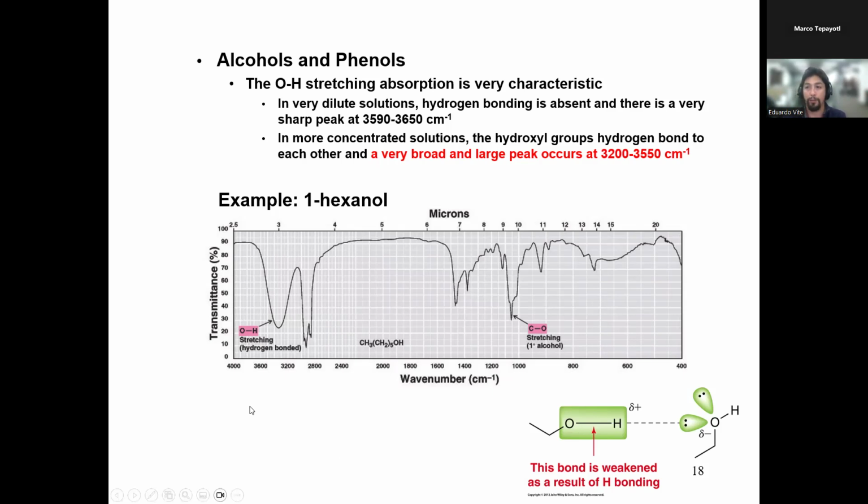But also, not only do you have the oxygen-hydrogen bond itself, you also have the hydrogen bond that is vibrating. And so that creates a very large range of absorption for these types of signals. And that is why, instead of having a very sharp, strong peak, the peak gets broadened and smoothed out. And so whenever you have an IR spectra and you see this specific broad, smooth peak around 3200 to 3600, you can bet that is an OH. That is an OH functional group right there for sure. This is distinct. There's nothing else that makes this specific signature right here.